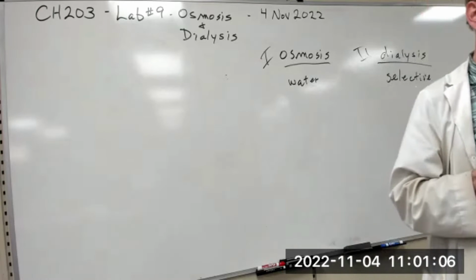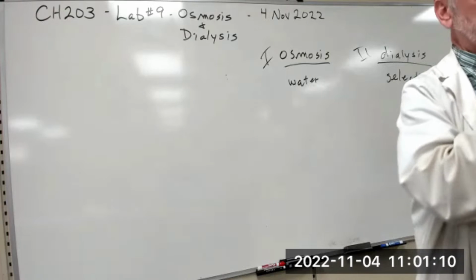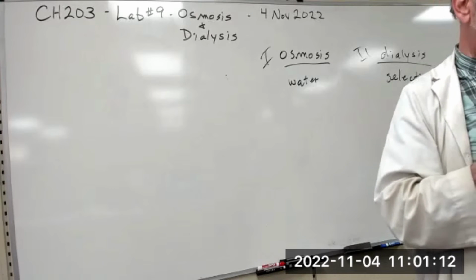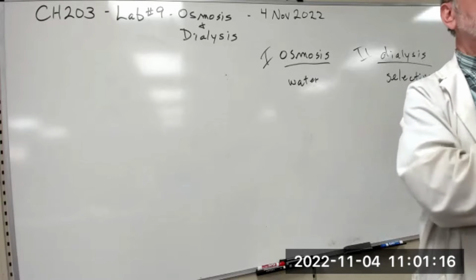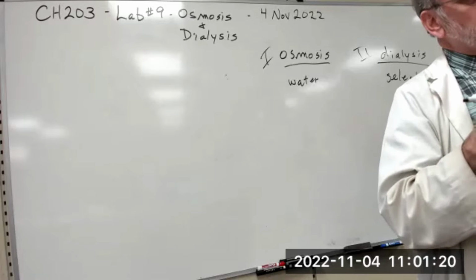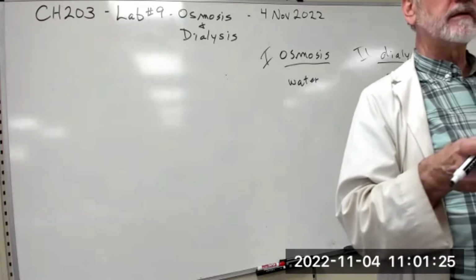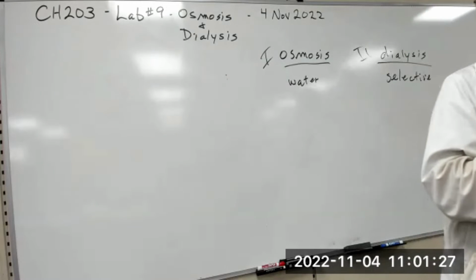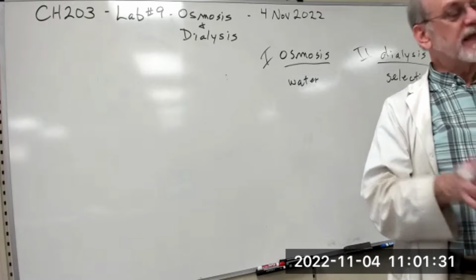So that's one caution. The other is you need to measure length. Right? There should be a ruler in everybody's bucket. Measure length before and length after. And I'm looking at your data sheet. And then, what are your qualitative observations? Right? Is it firm? Is it pliable? Use your own words. Okay, that's for part one.